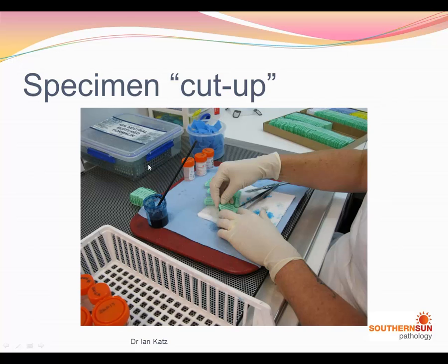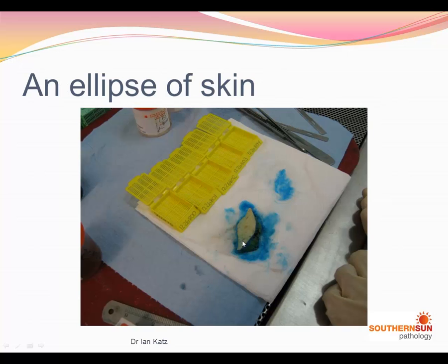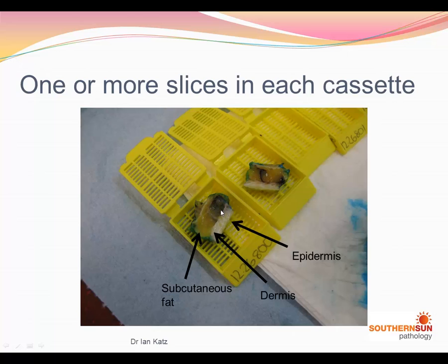A specimen ellipse looks like this, and we ink it to delineate the margins when we look at the sections under the microscope. We usually cut bread-loaf sections through it horizontally across like this, and place the different sections — sometimes more than one section in each cassette. This is what a bread-loaf, or a slice of the specimen, looks like.